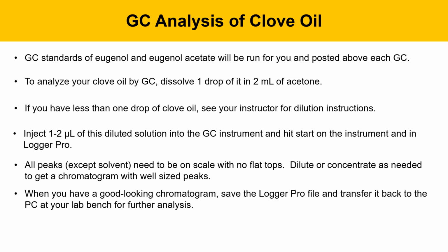Then once you have a good-looking chromatogram with well-sized peaks, you'll save that chromatogram profile and then transfer it back to the PC at your bench so you can do further analysis of it.